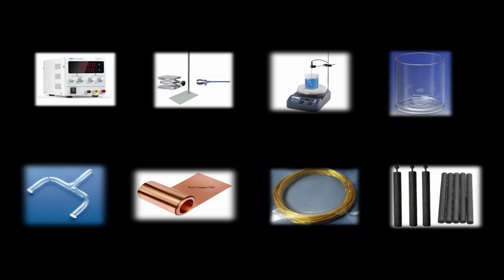Elemental rods may be used, keeping in mind that they should be of the same composition as the element that is being deposited. If silver is to be deposited, then that cathode, that is your working electrode, should be silver for easy refining. The graphite or carbon rods can be used as anodes, being your counter electrodes, or they may be reference electrodes.